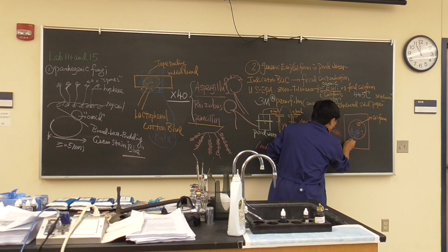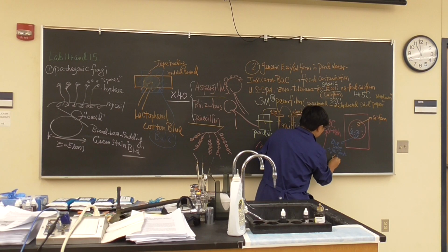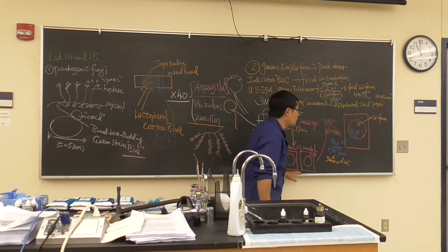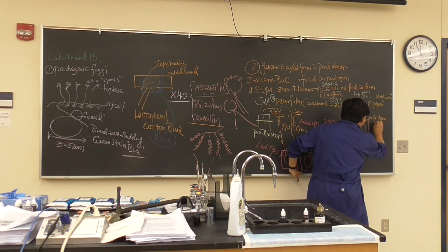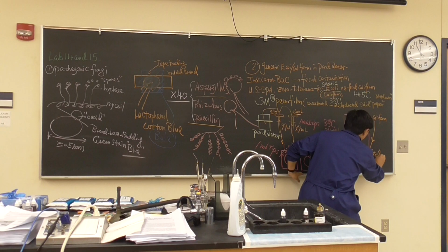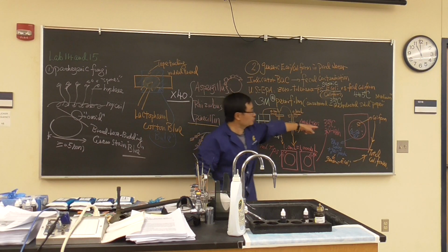So, blue colony with gas pack. This is generic E. coli. Okay, then if we combine it, this is called total coliform. That will be in your final exam, I tell you.